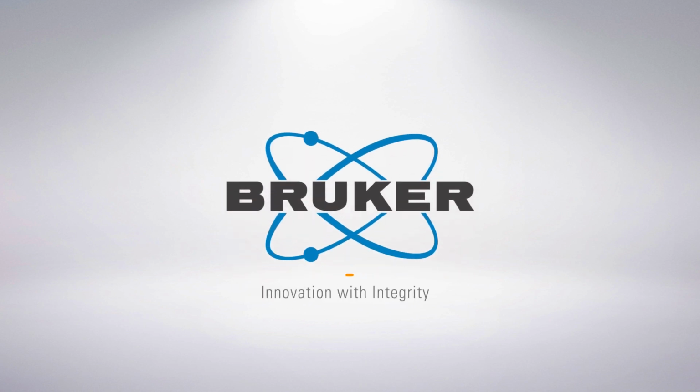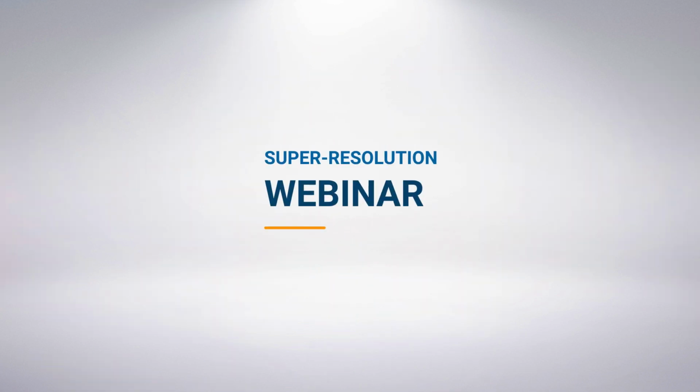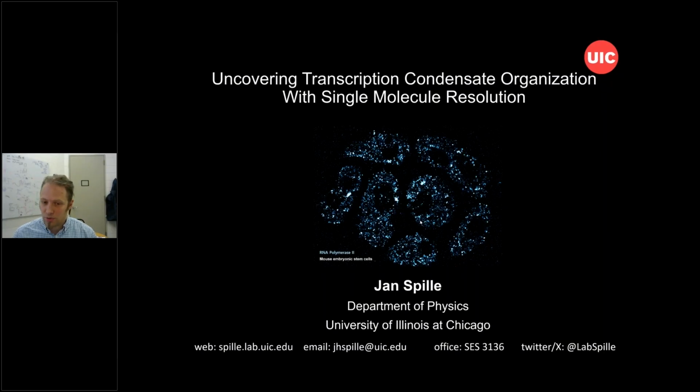So what I will tell you about today is our work on uncovering transcription condensate organization with single molecule resolution. I will spend a little bit of time introducing the system, going over some of the work that really set the stage for this, and then tell you more about our mostly super resolution work in fixed cells, but also take a little bit of time to start going into live cell single particle tracking work to really understand what these transcription condensates are doing, how they function in a very physical sense.